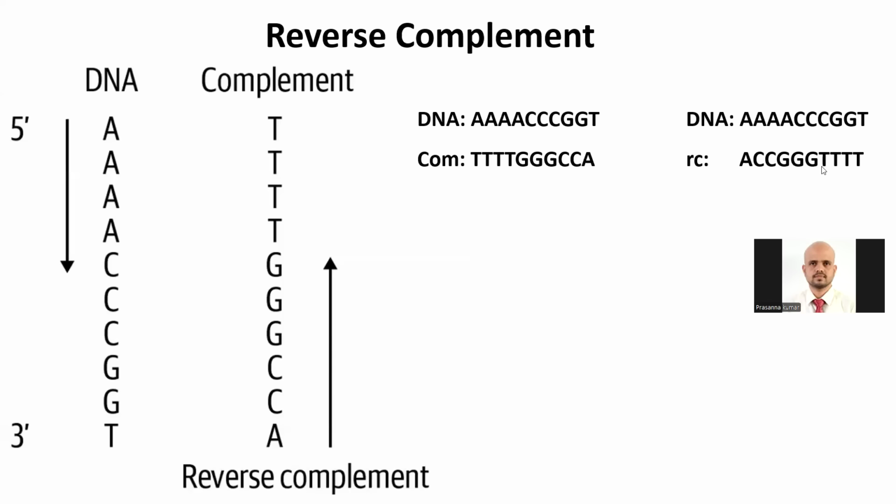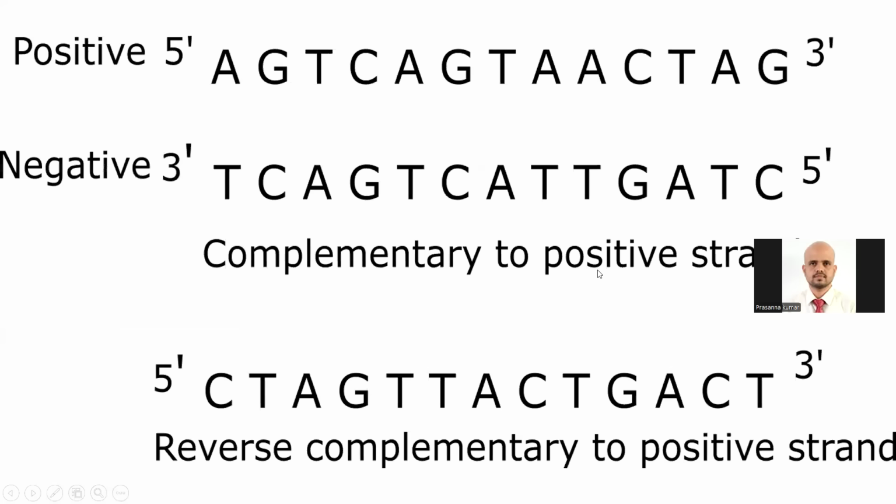You will know. Only by reverse complementing the reverse strand are you actually merging, or completing, your forward strand. I will show you how it is done. I hope this is very clear now.